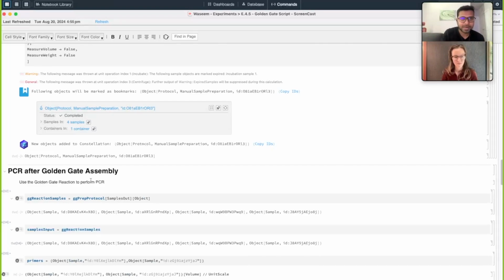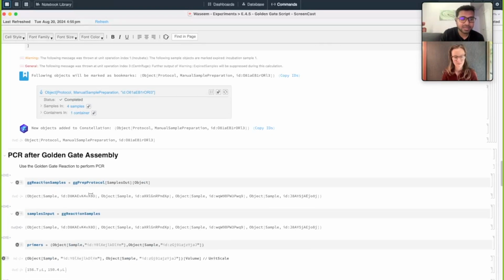Then here comes the important part that I mentioned, where we are adding the PCR components directly onto our reaction instead of taking a bit of our reaction and then performing PCR on that sample. The reason is that the reaction itself is 30 microliters in total volume, and pipetting out 5 or 10 microliters from it has been unreliable for us in the past. So instead, I'm just adding my PCR mix and primers directly onto our reaction and performing the PCR on the same plate.